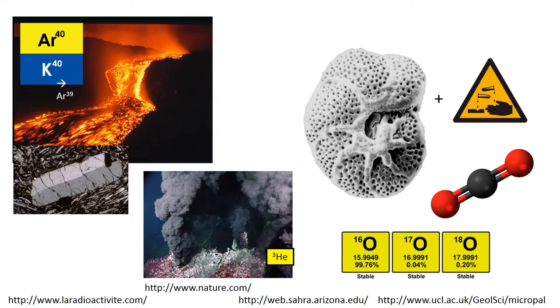So here are some examples of the kind of geological problems to which we can apply gas source or electron impact ionization mass spectrometry. Argon-argon dating or potassium-argon dating, when we're measuring the argon, we would ionize that with an electron impact source. Similarly, looking at some of the noble gases, maybe dissolved in seawater samples, we might be able to measure those with electron impact ionization mass spectrometry.